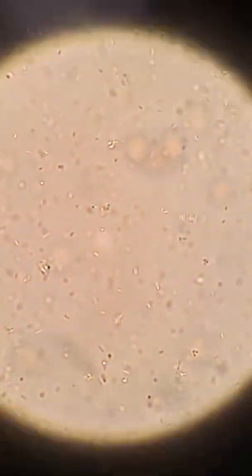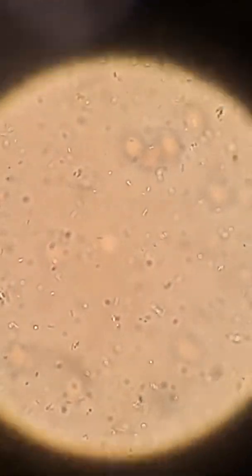What do you see there? This is one single drop. Now, tons of bacillus in here. Let me try and adjust this a little bit here for you.